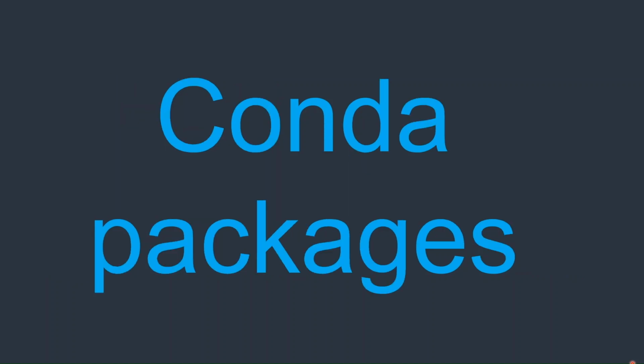Before I start talking about Conda packages, I want to give you a couple of examples of how we can install bioinformatics softwares, because it is important to note that not all the bioinformatics tools are available in Conda packages.